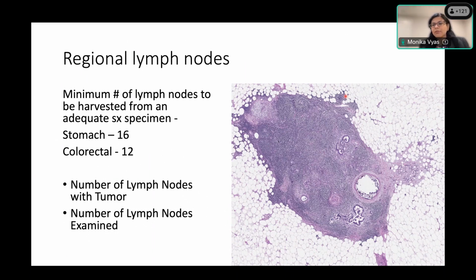And sometimes you may feel that you have 12 lymph nodes and you've met the requirement, but then the surgeon will come back and say that, oh, for this case, I had done a high ligation and I expect more lymph nodes. And it's prudent to go back, because again, it's not just about finding 12 lymph nodes, it's trying to sample all the lymph nodes. So whenever we are talking to trainees, the emphasis has to be that you try to submit all possible lymph nodes and not just try to reach a number and stop. So that is a very common misconception. And it's important to re-emphasize this with the prosector so that they don't stop at the given number of lymph nodes.